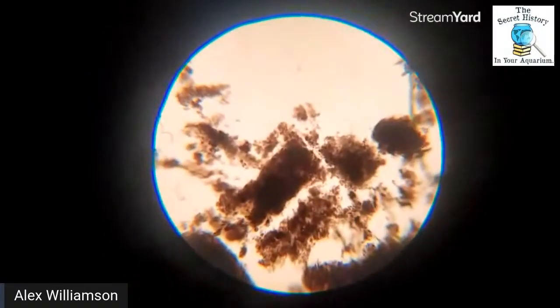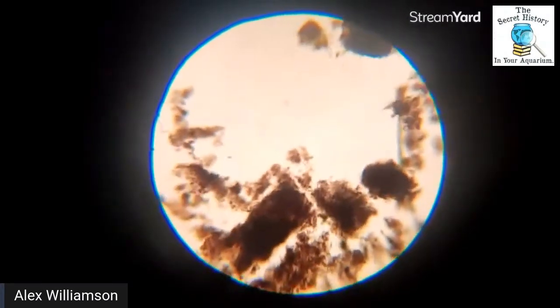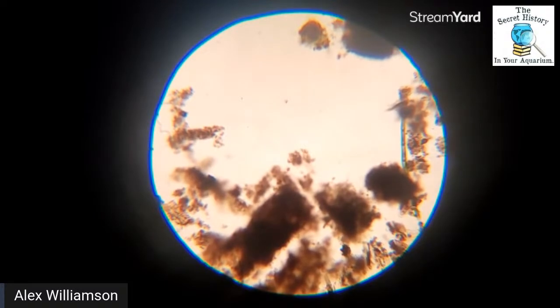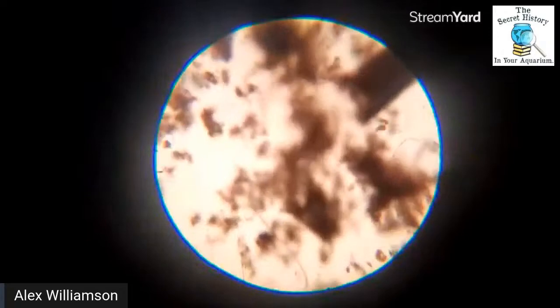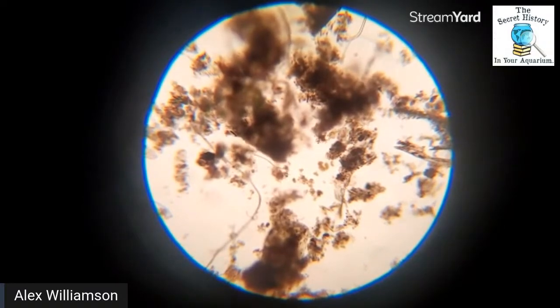All right. So this is mulm. So exciting. You don't always see a ton when you just straight up put something on there. But what we can see already is that the algae over there on the far right, that green stuff, that's algae. And algae has cell walls generally, unless it's a singular algae, like a planktonic algae, then it can look different. But if it is strand algae or hair algae, it will have these boxcar shapes on it. And so we'll see it there.